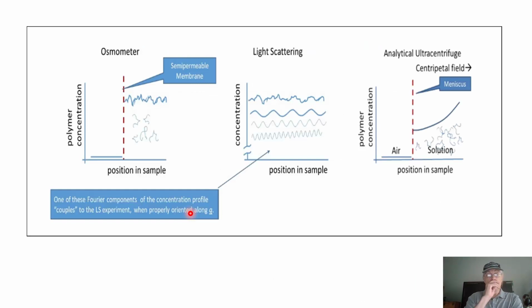Okay, so the one thing I want you to understand straight away is where light scattering fits into the general picture of things here. Surprisingly, it is a kind of thermodynamic method. It's not going to seem that way for a little while yet. It'll look like we're just looking at particles and so forth. Most of the things that you study are actually approachable from at least two directions. And in light scattering, it would be a particle-based view of the process and a thermodynamic-based view of the process.